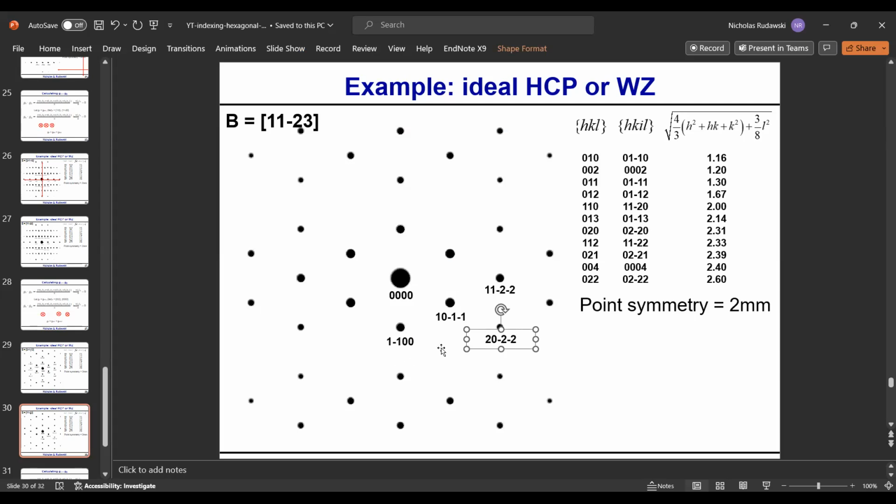Did I mess something up here? Let me see. No, that's correct. Okay, now that works. Nope, everything's good. Let me copy this. Flip all these. Okay, do a few more here.